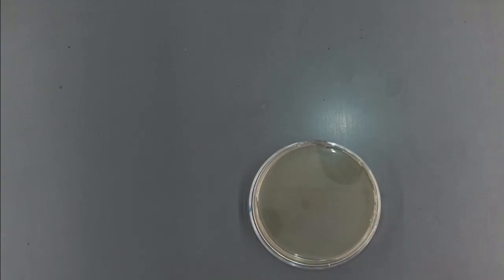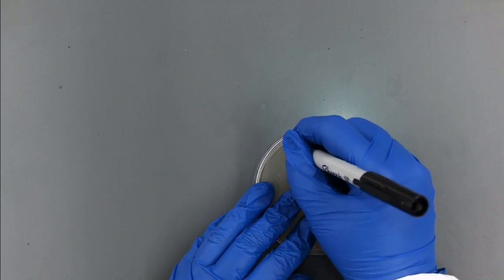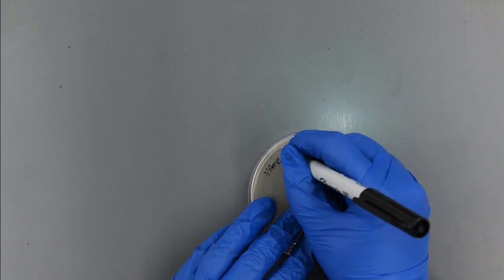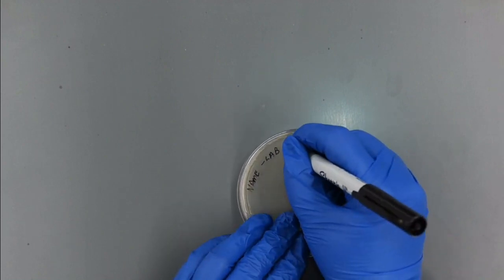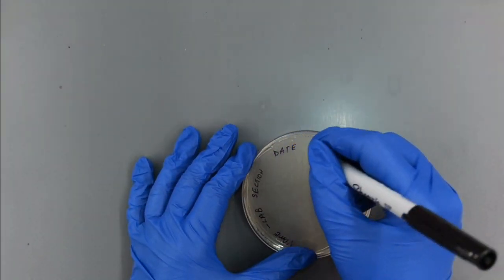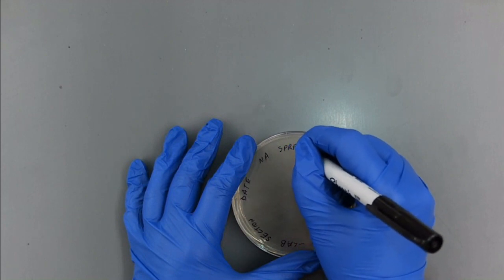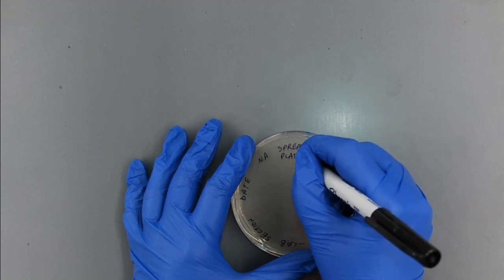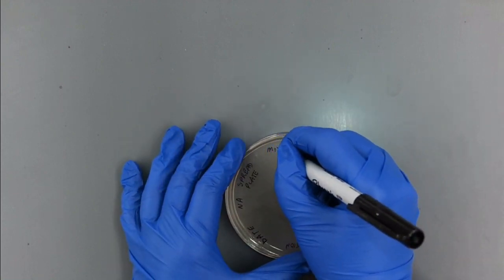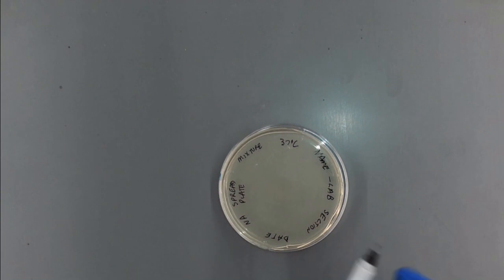What we're going to do next is label the plate. As always, on the bottom of the plate, the name, lab section, the date. This is Nutrient Agar spread plate. And this is a mixture. And we're going to be growing it at 37 degrees Celsius. So we'll go ahead and put that in the incubator.